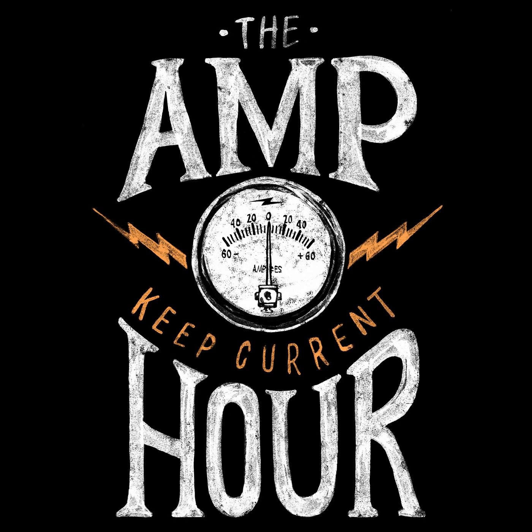Although I'm probably never going to run out of gold on one of my targets, just because I'm not using my coater 24/7. But if you're in a facility that's running the sputter coater every day, multiple times a day, you're going to have to replace targets every so often. And depending on the target, because different style targets will have more or less gold, you're looking at anywhere from $500 to $2,000. Well, that's not small. But it's also not that much in the grand scheme of things. It's a very, very thin coating of gold, so the cost per sample is still very low.